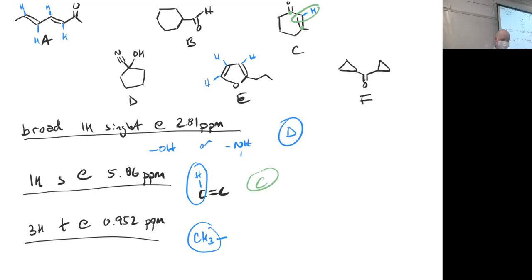Okay, so what's it next to? A CH and a CH, or just a CH2. Oh no, it's just a CH2 because it's three. Exactly. Only one bond, so just the CH2. And then as you were saying before, it's on the low end of that, so it's not really near anything exciting. So which one of those structures could match this?